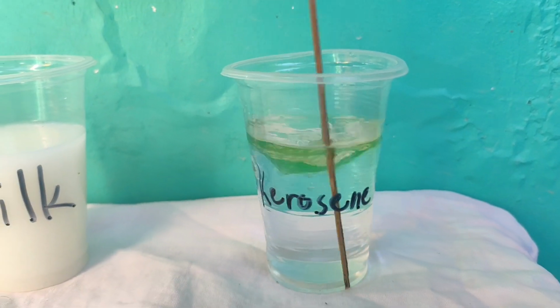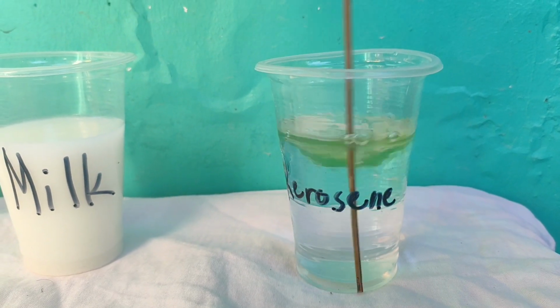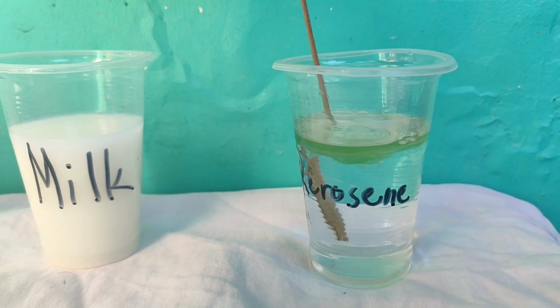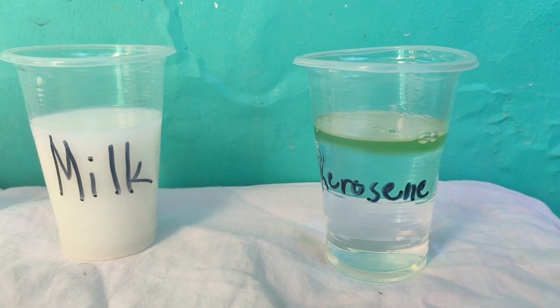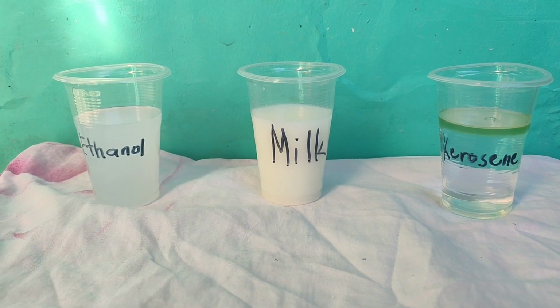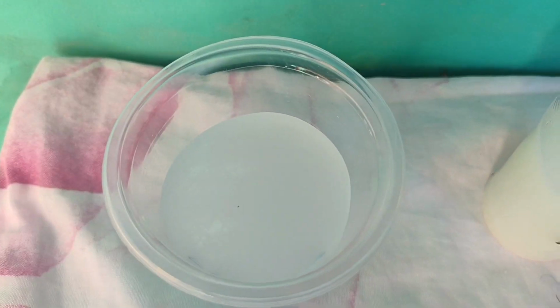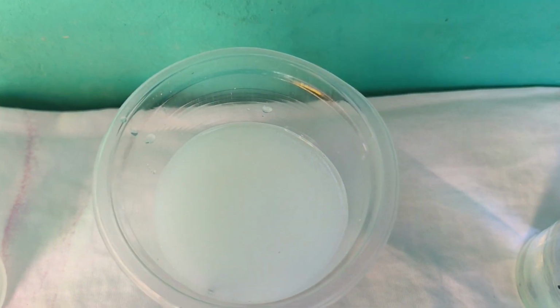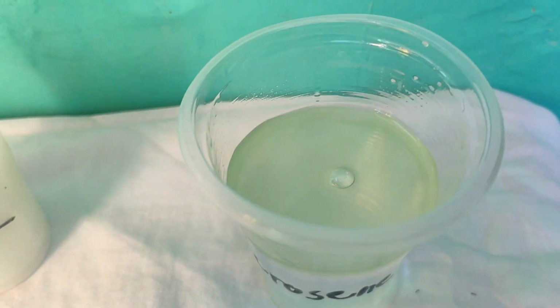The kerosene and water mixture does not combine very well, just like the cooking oil. It floats above the top of the water, creating a surface of kerosene. So based on my observation, the ethanol and the milk are soluble in water and the kerosene is non-soluble in water.